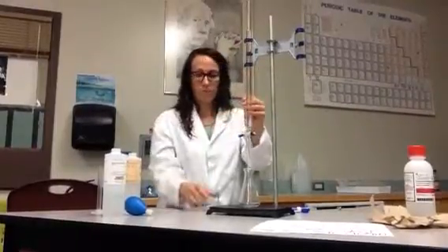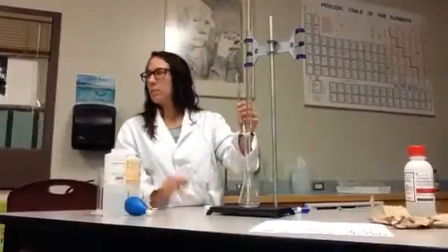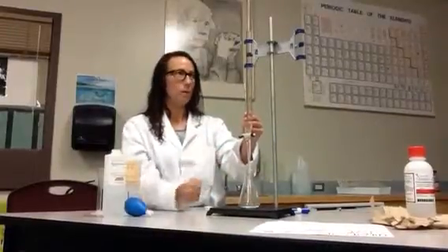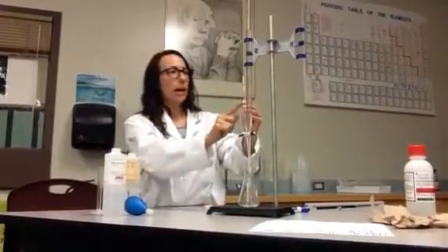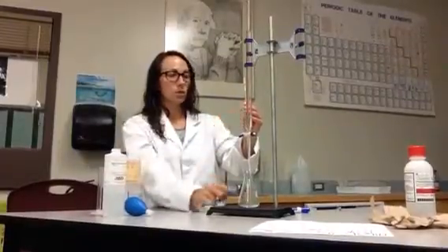And then let go, and just let it drain. There will be some left in the tip, and that's accounted for. It's called calibrated. So this has been measured to have whatever's left in the tip supposed to be there, so there's no need to take it out. So now I have exactly 10 mils of my acid, and I'm about to find out how much volume it takes of this base in order to react.